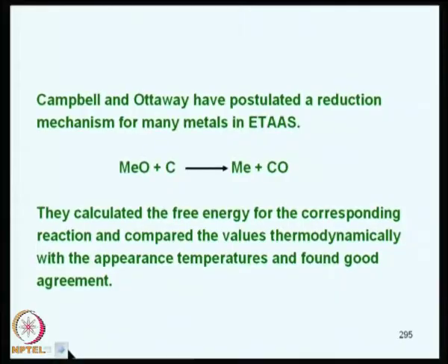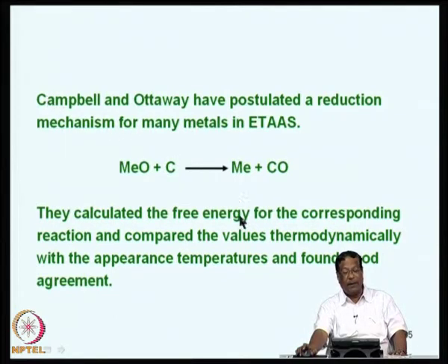So, what are the types of mechanisms that happen in graphite furnace technology? Campbell and Ottaway have postulated a reduction mechanism for many metals in electrothermal atomic absorption.